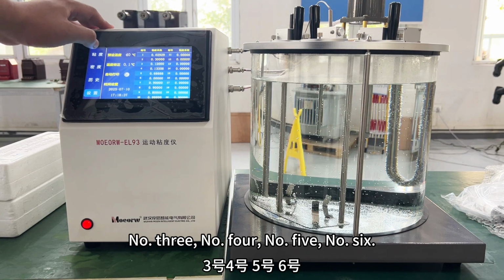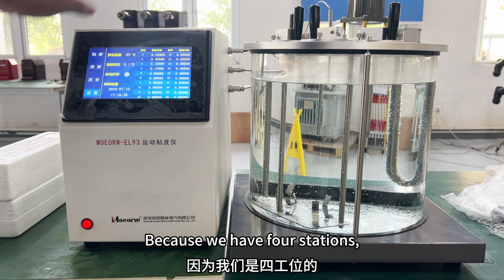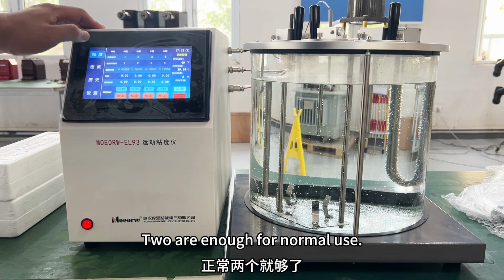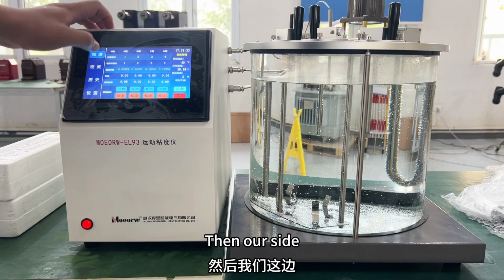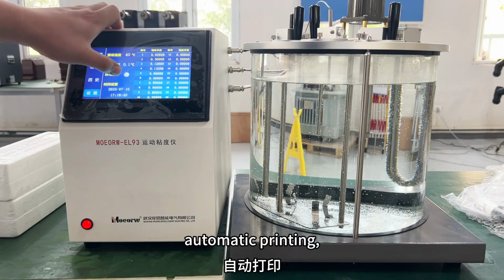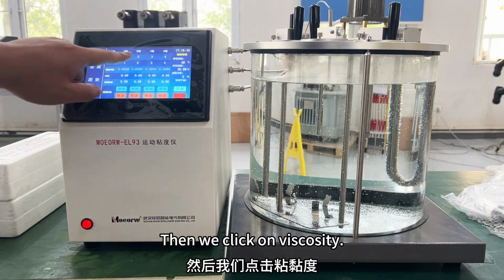number 5, number 6. According to our normal use, because we have 4 stations, we can set 4. Two are enough for normal use, 1 or 2 are fine. Then outside, there is also an automatic printing and correct the degree. Then we click on viscosity.